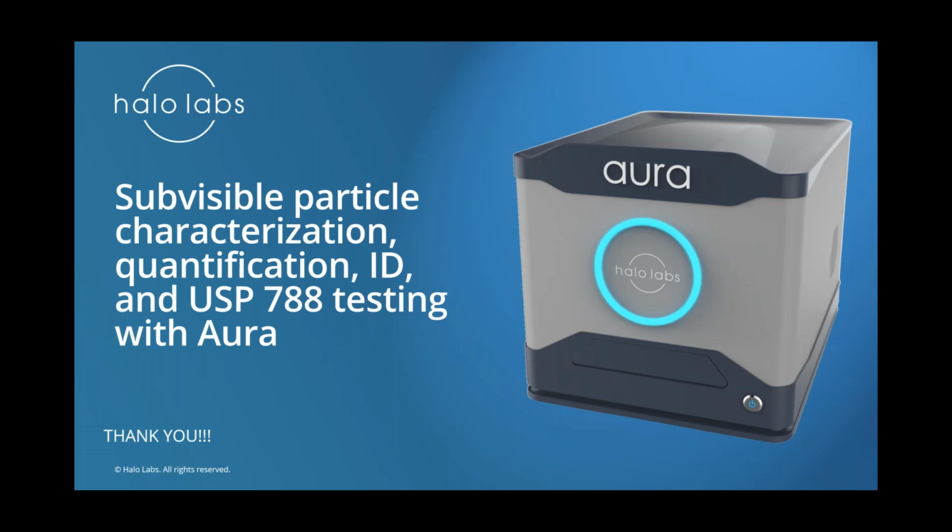Okay, great. Thank you very much. And another question is, do we have CFR Part 11 software? Yes, we do. Great, thank you very much.